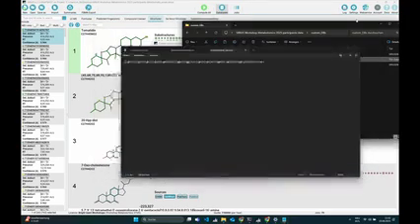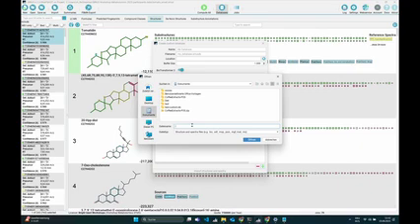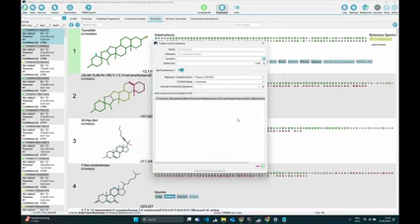Oh, yeah, right. I didn't show you this, but if you click on the plus sign, it actually shows you. So now you can select structure files here, and it will show you that TSV, CSV, or SDF are currently supported. Okay, so now we would have created a database for these biotransformations of tomatidine, but let's not do this right now live.